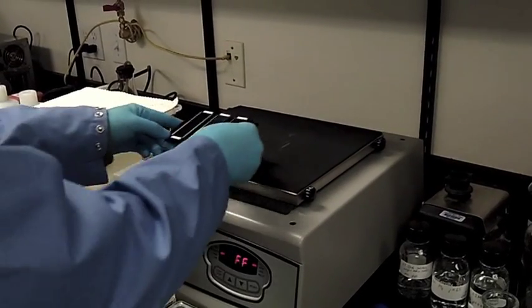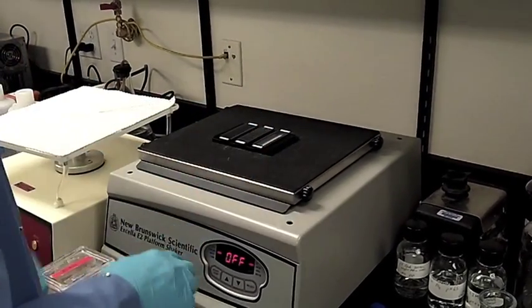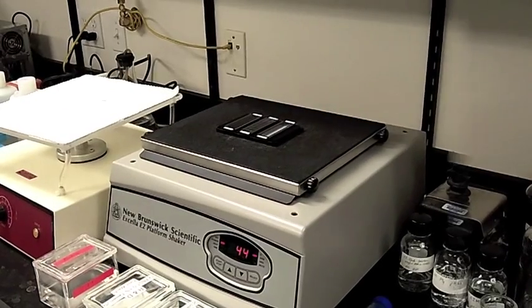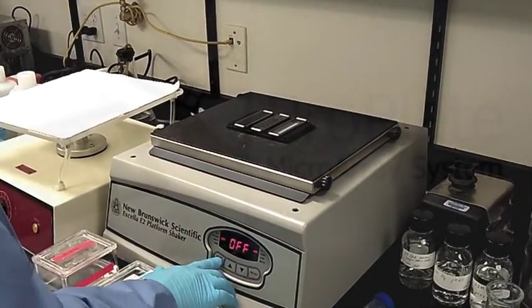The ProPlate assembly is then placed on a shaker or rotator to actively mix during hybridization and then removed when the hybridization is complete.